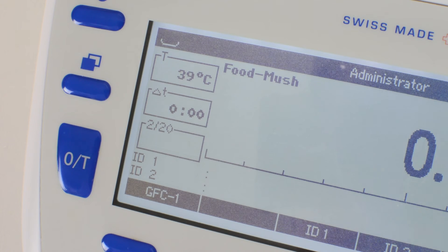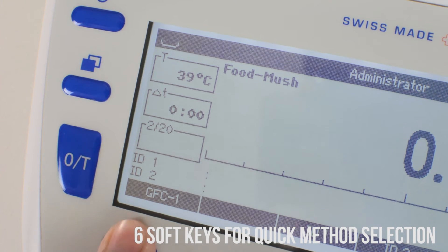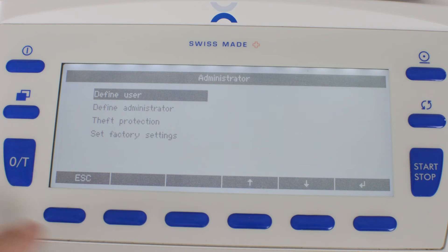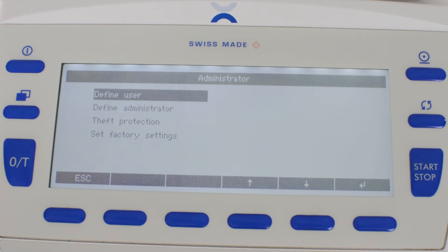Each of these methods can be pre-programmed onto a soft key so that you may select your method with one press. Multiple users can log in to the balance with a password. The users can have varying degrees of access so that only administrators can gain access to method and balance settings.